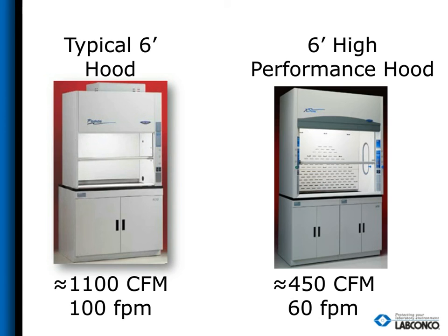So here we have a typical 6-foot fume hood that requires 1100 CFM to exhaust on the left-hand side there. This means the fume hood's operating at 100 feet per minute face velocity with the sash fully open. If this exhausts all day, every day, it will cost about $8,800 per year just in energy costs.